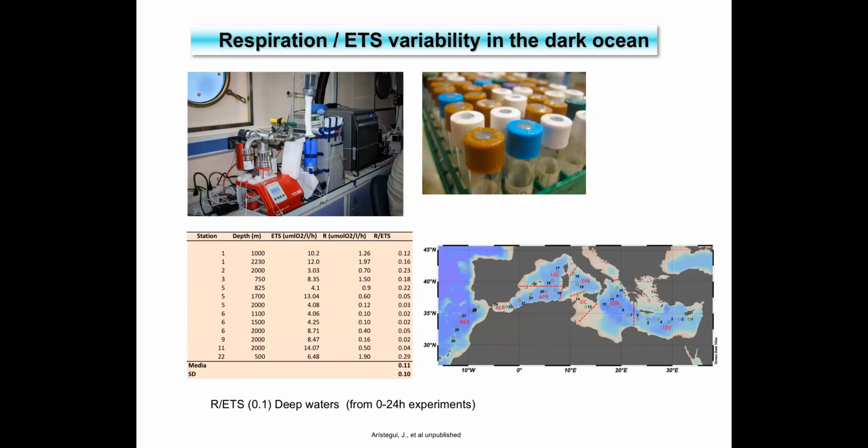There are some other data that we have, unpublished, and these were collected with MIMS. That's the MIMS that I have, which is available for the training course or lead experiment, if someone, a volunteer, comes to my lab. We brought it to a cruise and ran a number of samples, which were like time series, but we only collected the information from the first 24 hours, because after that there was growth of the organisms inside. And mostly they are from the eastern basin of the Mediterranean Sea, from the Levantine and Ionian Sea, and some close to the Alboran Sea also.